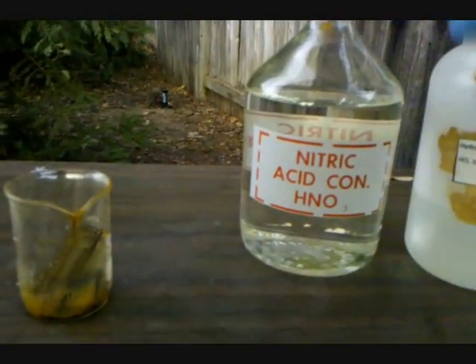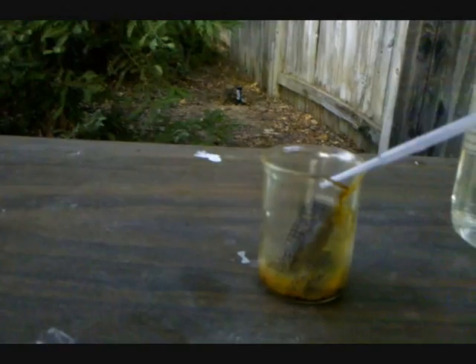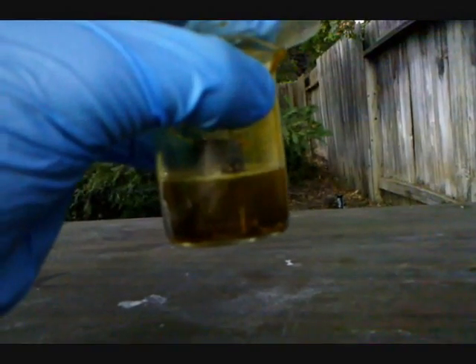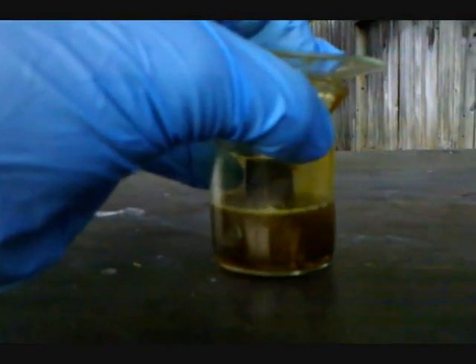I'm going to be adding that to this beaker and showing you the reaction once I get started. Here you can see the pins of the CPU bubbling in the acid solution. I put a watch glass on top of the beaker because it can splatter a little bit. Let it sit until it stops bubbling — however long that takes, it might vary.